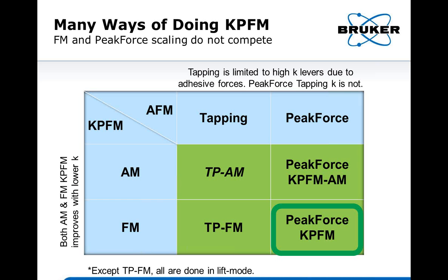So now let's take a look at how many ways we can do KPFM. We know that KPFM really is a combination of an AFM mode and a KPFM mode. For KPFM itself, there's AM, which is amplitude modulation detection KPFM, and also there's frequency modulation KPFM.